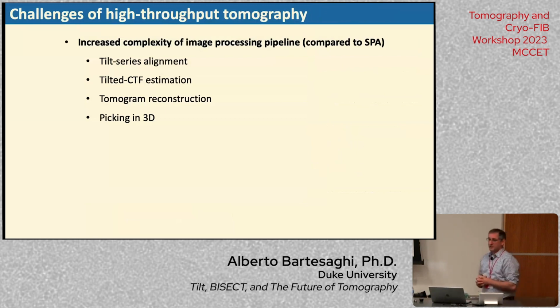Okay, so having a lot of data is great, but it's also very problematic. Right, we are not actually used to having big data sets. So until a couple of years ago, we didn't know what to do with all this data. We were stuck for a while because we didn't know how to process or push that through the pipeline. In particular, if you come from a cryo-EM background, cryo-ET is a lot more involved. There are more steps. There are more things that need to happen in the right order.